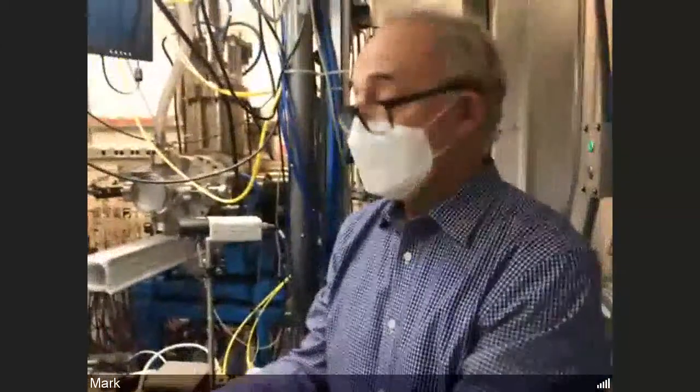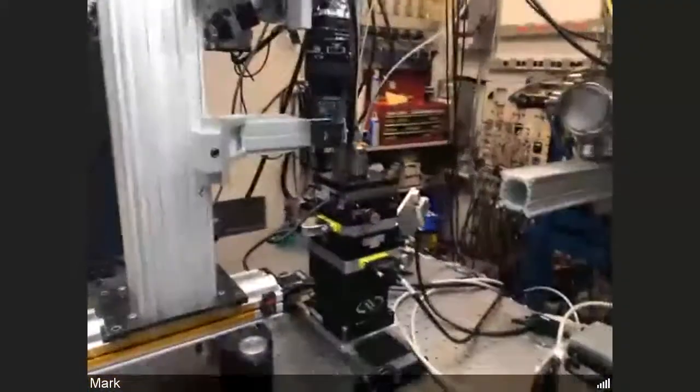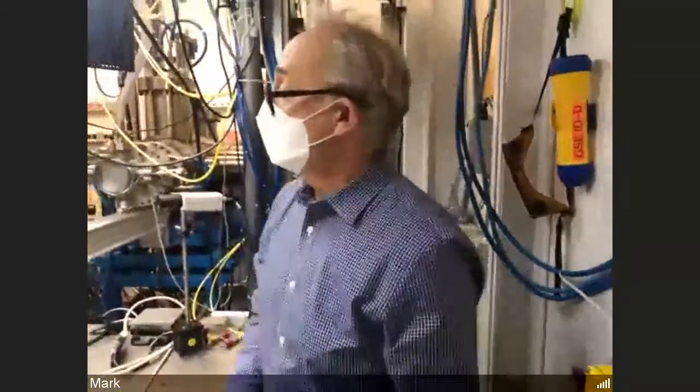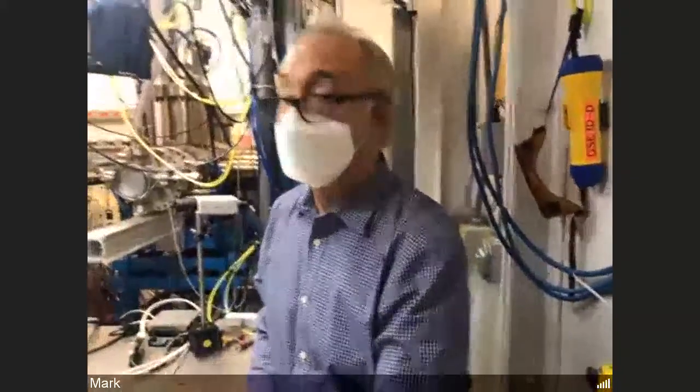So that's all that's involved, and I want to get it so that it's roughly in the center of the drill chuck, just to make life easy, but it's not critical at all. So, mounted the sample, I'm now going to turn out the lights.